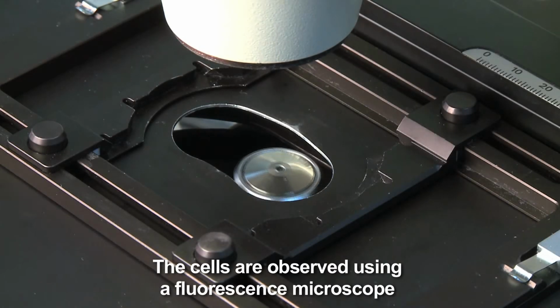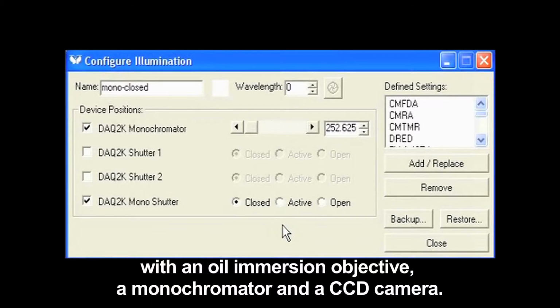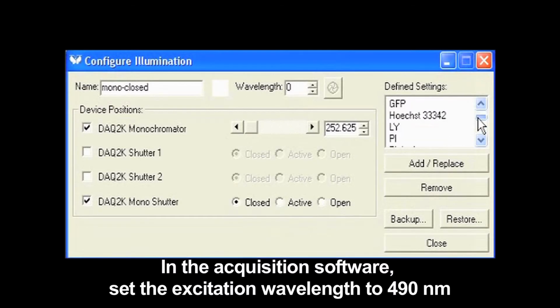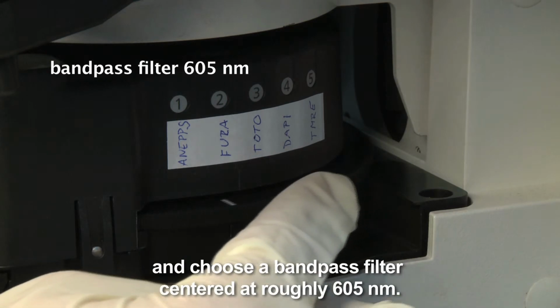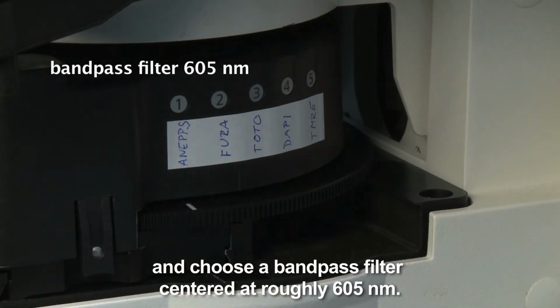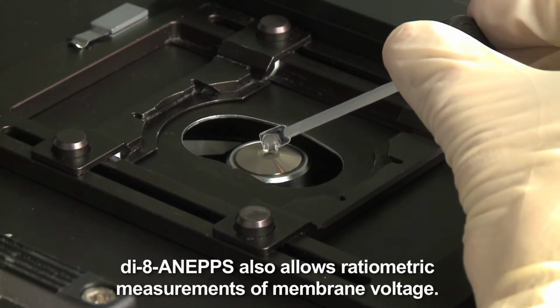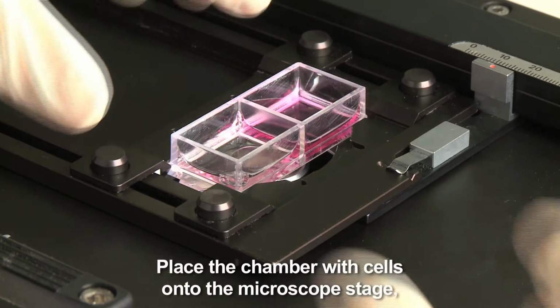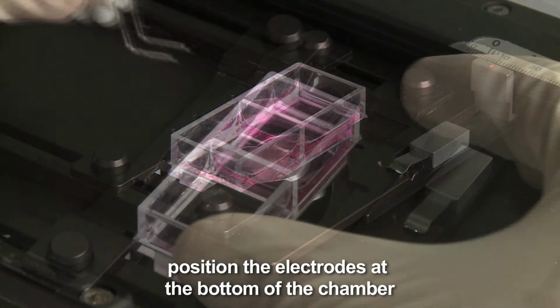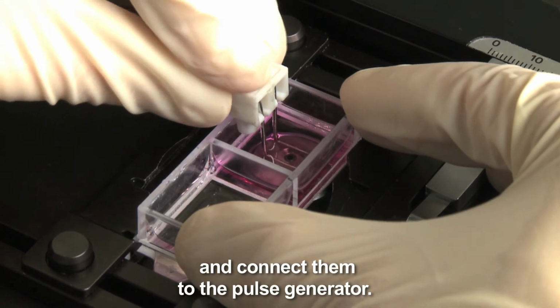The cells are observed using a fluorescence microscope with an oil immersion objective, a monochromator and a CCD camera. In the acquisition software, set the excitation wavelength to 419 nanometers and choose a bandpass filter centered at roughly 605 nanometers. Although not applied here, di-8 ANEPS also allows ratiometric measurements of membrane voltage. Place the chamber with cells onto the microscope stage, position the electrodes at the bottom of the chamber and connect them to the pulse generator.